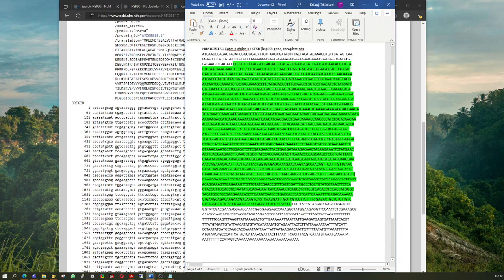And as you understand, if you followed in class and all the explanation, when the polymerase starts to read, it's not always accurate. It could be shaky from the sequencing machine. So the few base pairs that are read from the beginning are not always accurate, and the last ones are also not always accurate.